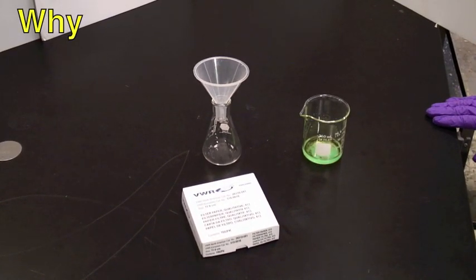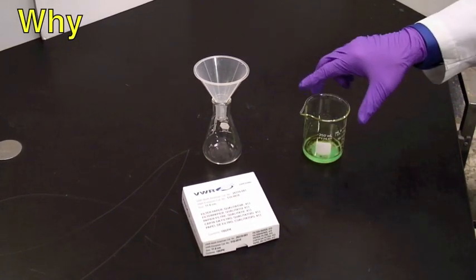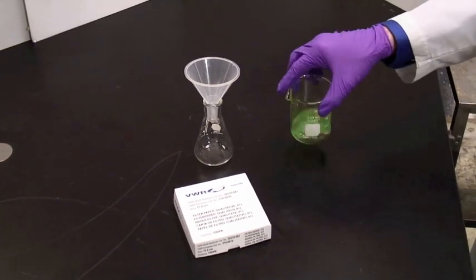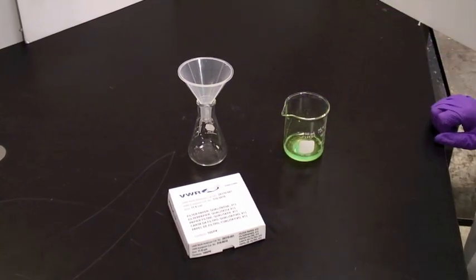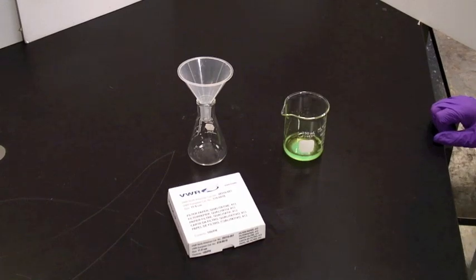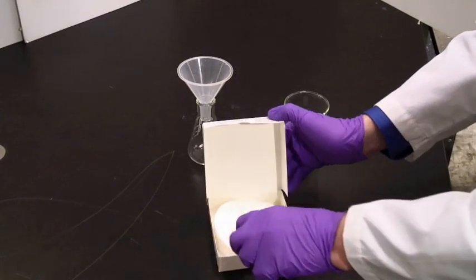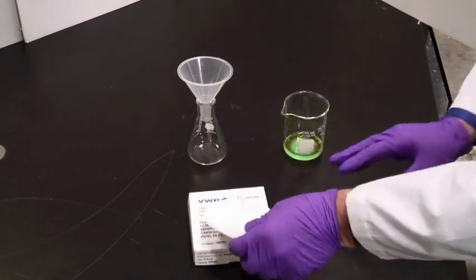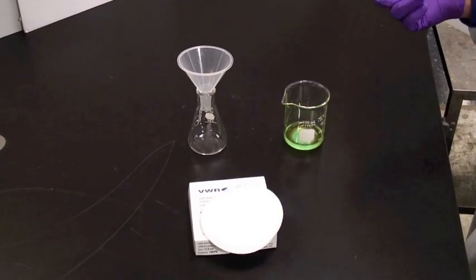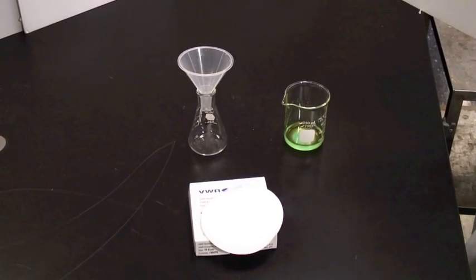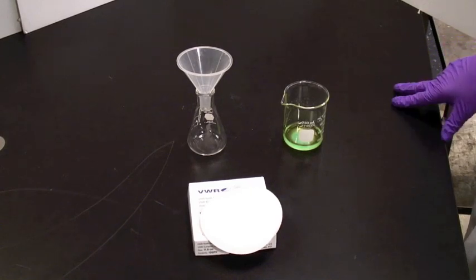Filtration is a separation process. Frequently you will have solids mixed with liquids, as we do here, and you want only one of the two. Pouring the mixture through a filter paper allows you to separate the liquids and the solids, keeping the solid behind and the filtrate, the liquid, coming through.